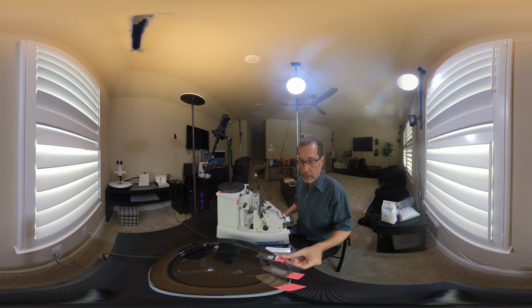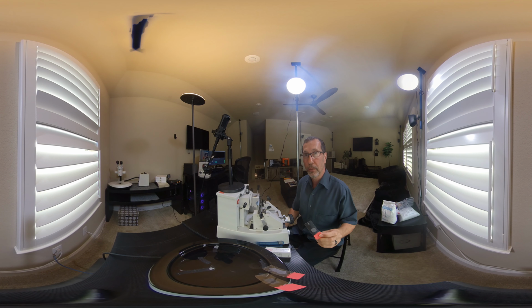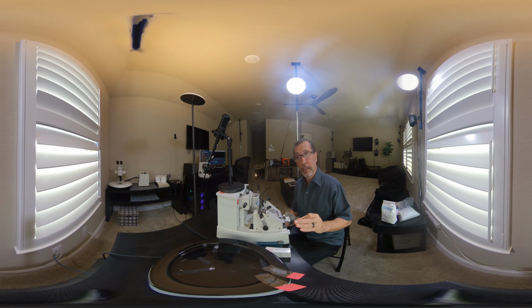So now that we're done cutting, the next work area is staining. So we can't just send this to the staining and just put some stain on this, because the great thing about paraffin is it protects the tissue. And so it would do that. If you put it in a stain, it would just not stain it correctly or at all. So we need to remove the paraffin at this point.